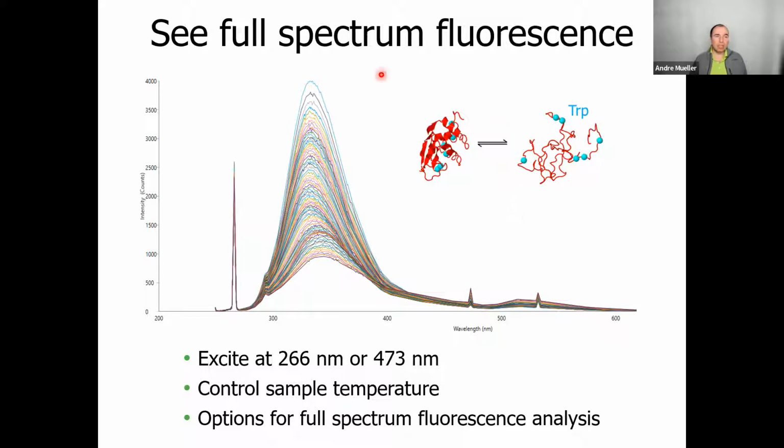And these fluorescence reads with progressing temperature are showing lower and lower intensity. They also, if you look at where the maximum is placed, it shifts a little bit to the longer wavelengths. It shows a typical redshift.